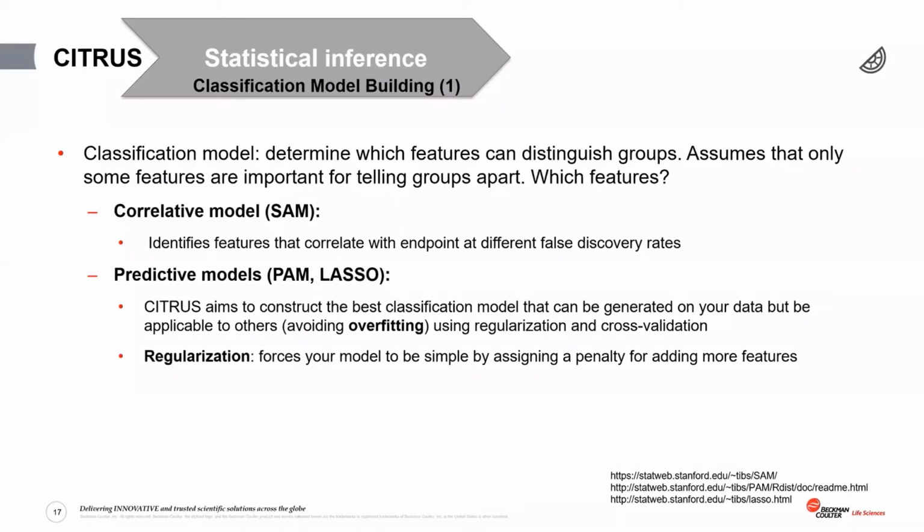The predictive models can assess the effect of interactions between multiple variables. For example, we saw that by looking at both fruit texture and shape, we had a model that best predicted if a fruit was a citrus. However, we also saw that the model with two features instead of one was overfitted to my sample. The model would be wrong in the case of the oblong citron fruits.